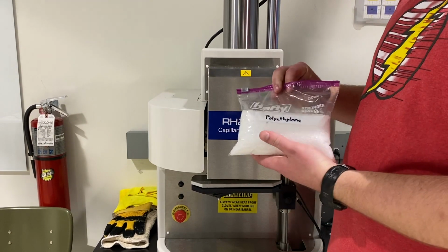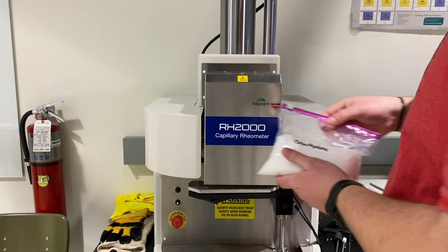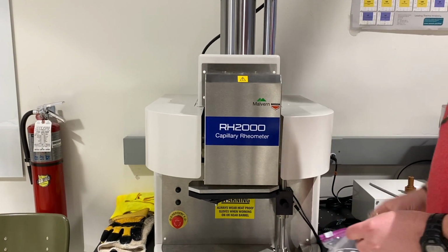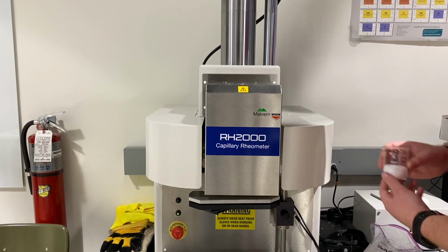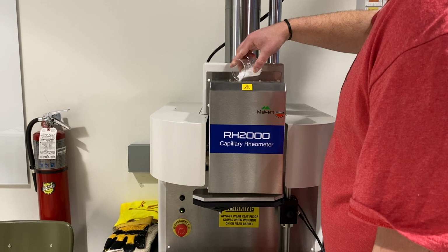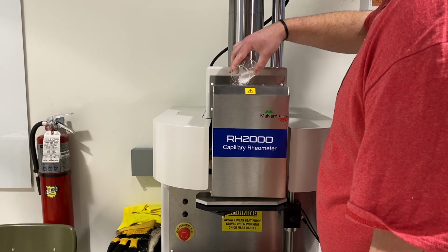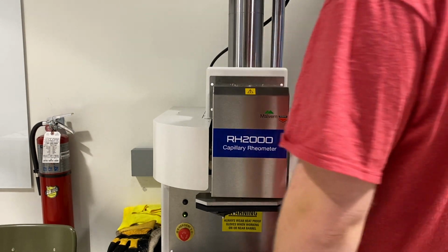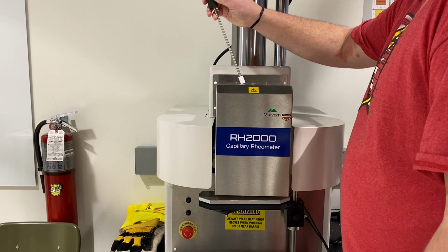So we're going to go ahead and load our material. This is polyethylene, specifically high density polyethylene. I'm just going to take a scoop into the beaker. Spilled some. Okay, just going to pour it in. If you're wondering, the immediate area is indeed very hot, even in the air.